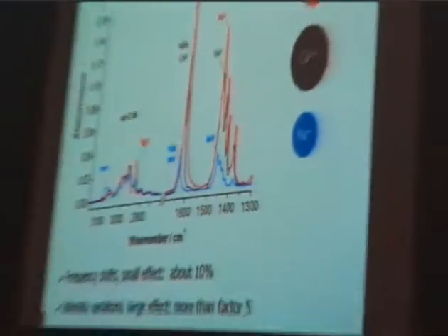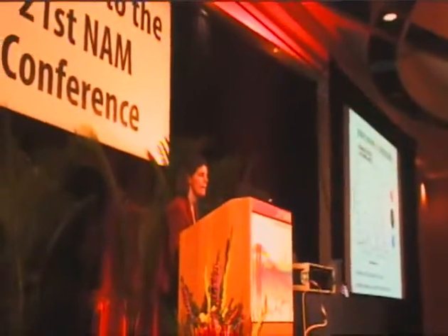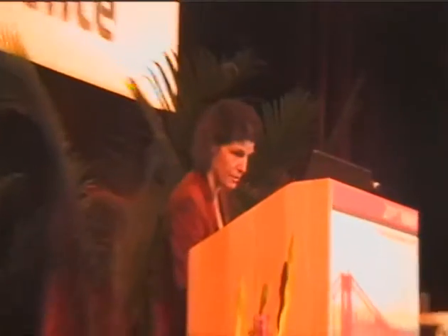And we can see that as we go from sodium Y to calcium Y to magnesium Y, the relative intensity of the CC stretching vibration is increasing, and this is consistent with our hypothesis that it would be perhaps more activated on a bivalent cation in comparison to a monovalent cation. And the calcium is, of course, in the middle because it has two charges, but it's a very big ion, and so the charge is relatively distributed.